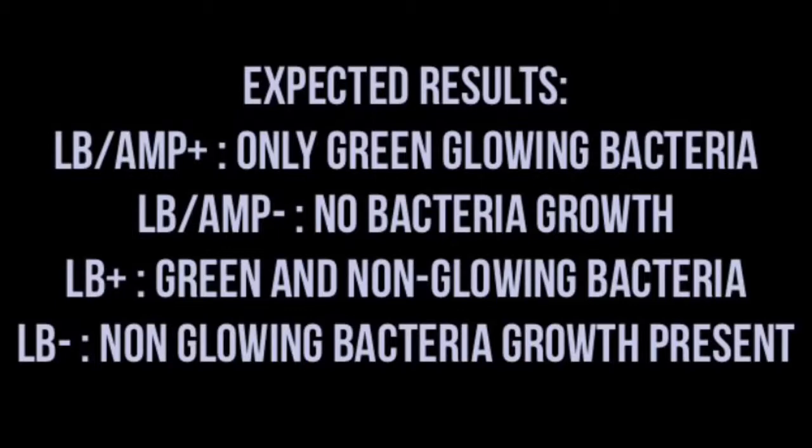This could be due to many different factors that could prevent the bacteria from becoming competent. If the heat bath was too hot or cold, the bacterial membrane would not be able to become competent and would be unable to accept the plasmid. Bacterial handling could have reduced the alive bacteria as well. When handling the suspension, bubbles formed which could have harmed the fragile bacteria.